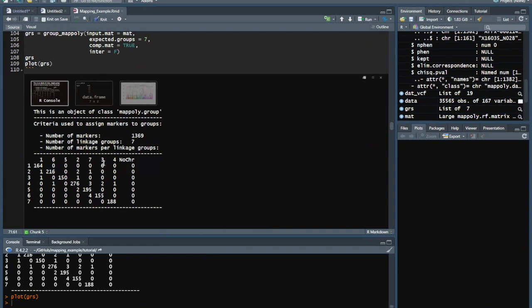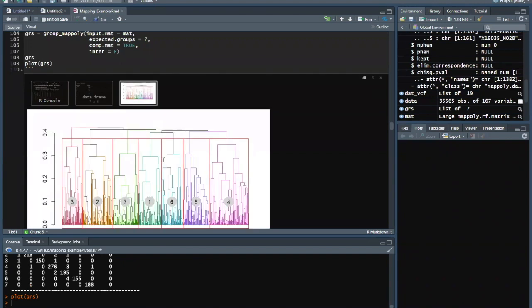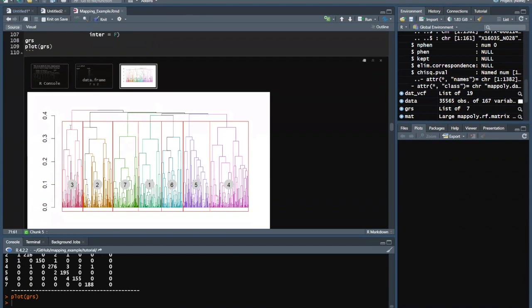You see a few that aren't grouped, with their genomic order. You also get an output of all the markers into groups, something more familiar that you would see, I guess JoinMap does something similar, where you see where all the groups fall out. This is similar.